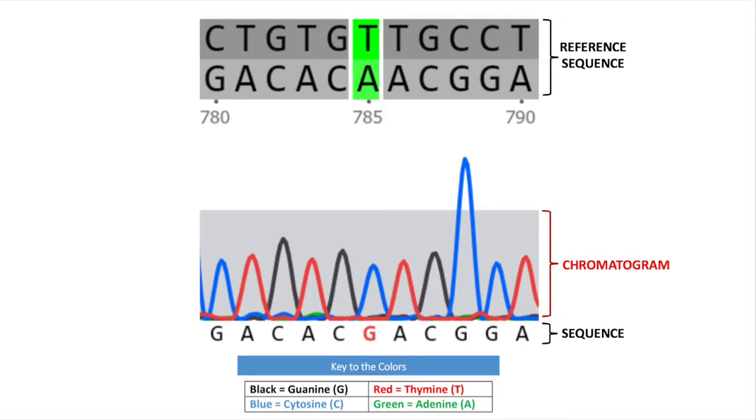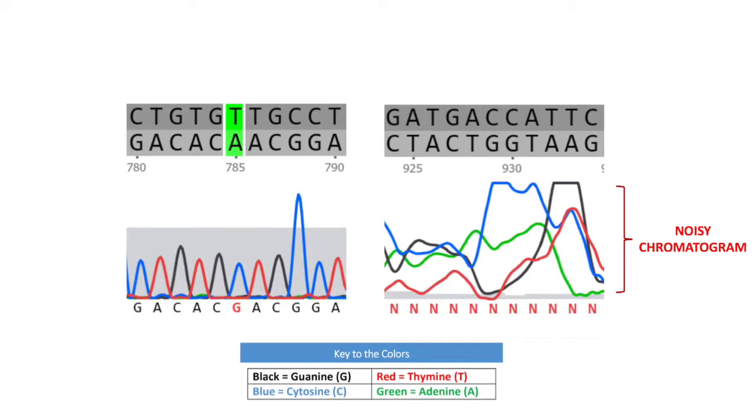Chromatograms tell us how confident the sequencing computer was when it identified a particular base at a given location in a DNA fragment. It uses color-coded peaks to designate a particular nucleotide. Evenly spaced, tall peaks are most accurate. Sequencing software tends to be most accurate in the middle of a fragment and less accurate towards the ends. This is why chromatograms are often very irregular looking at the beginning and end.